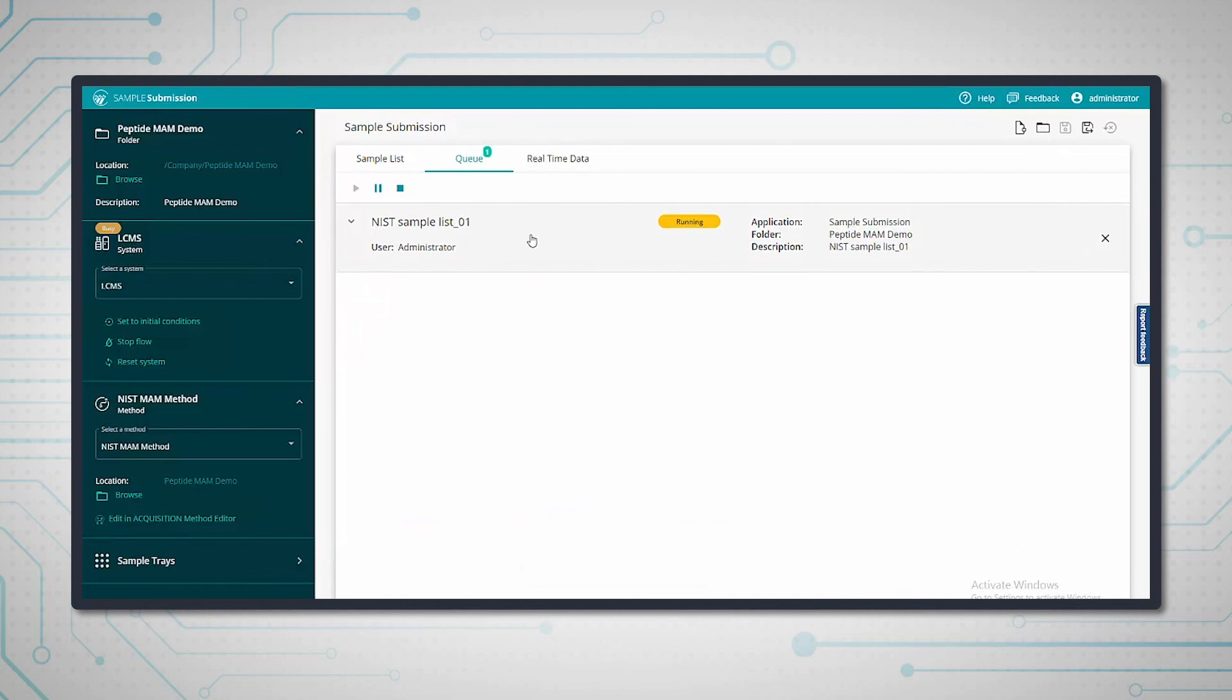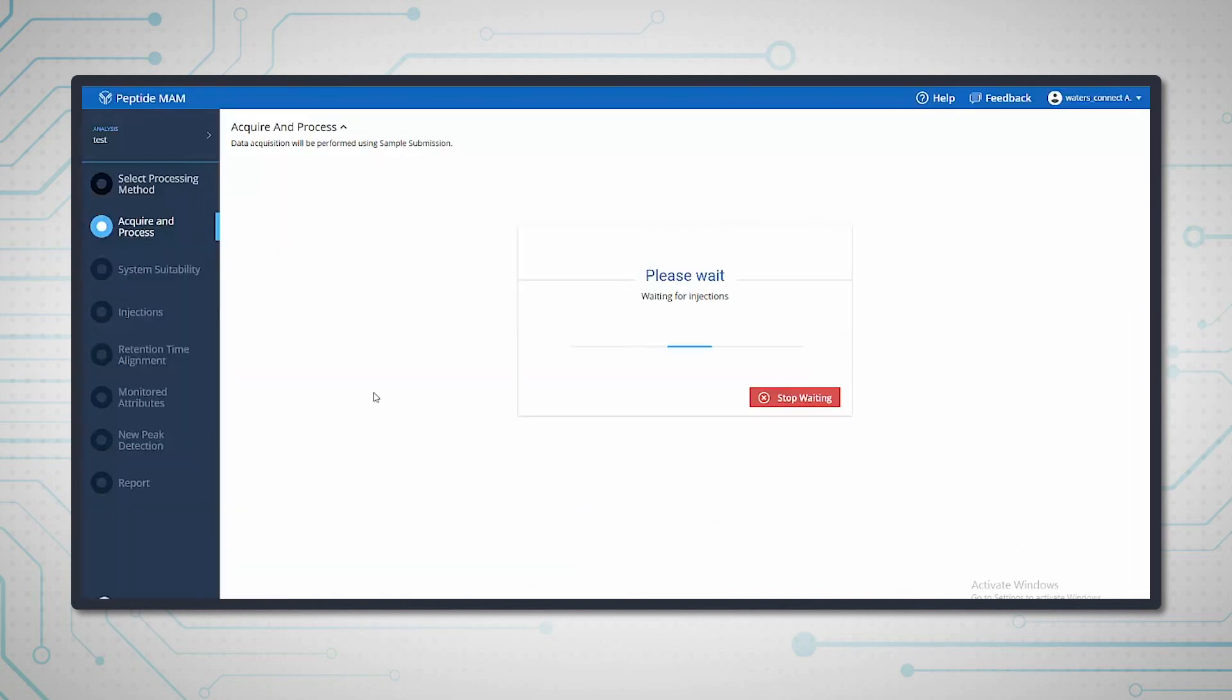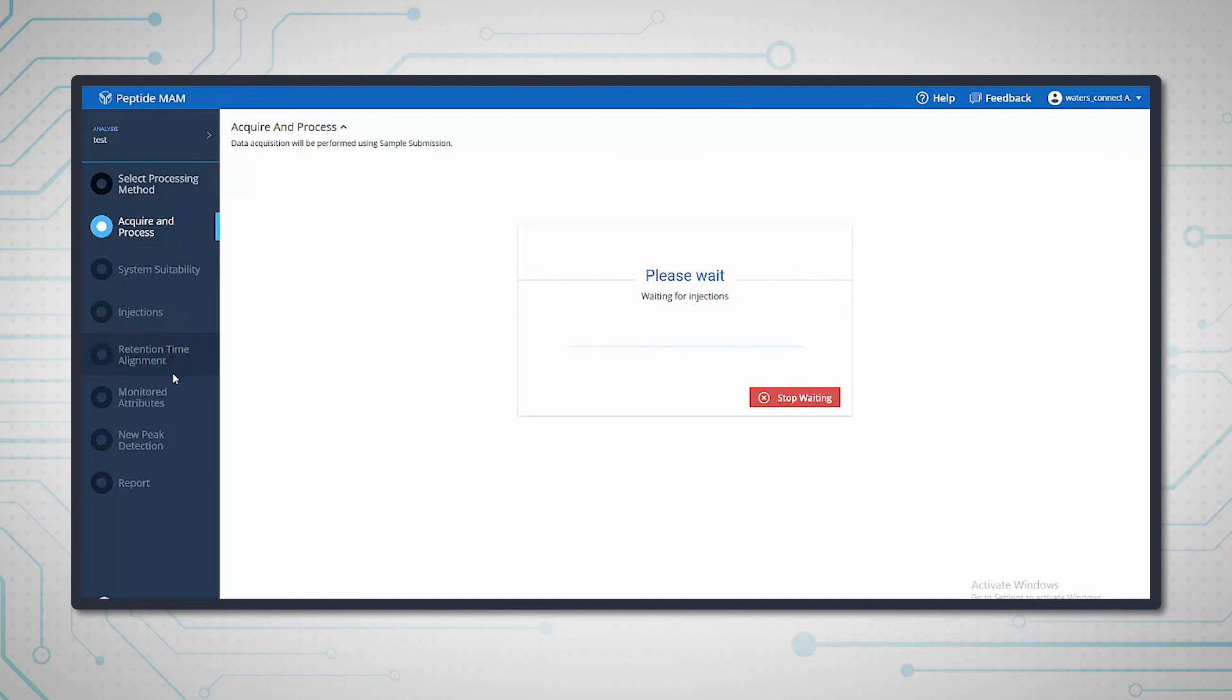If we go back to the peptide mam app, when the processing is complete, we'll come back to the analysis workflow. Then we'll be able to go into the additional steps and look at the processed data. We'll do that in the next section.